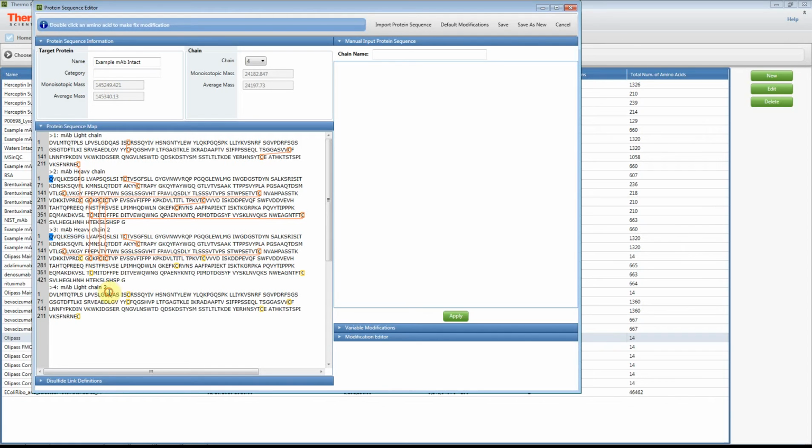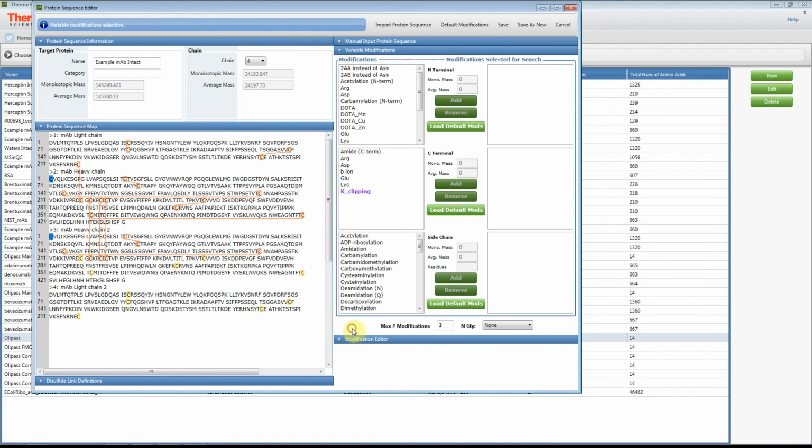And so now the mass has changed. Once you have all your disulfide bonds linked, and you add any static modifications, you can come and look at the variable modifications. Here, you could choose between two different glycans. This is for N-glycan modification. We have a CHO database and we have a human database, and you can select either one of these. There are about 200 different glycans in the databases, so this is a very extensive glyco search whenever you're choosing one of these two.